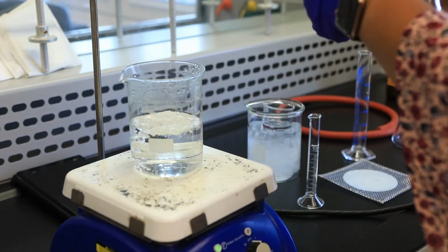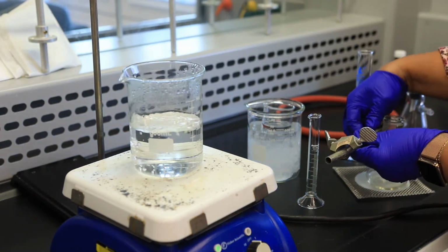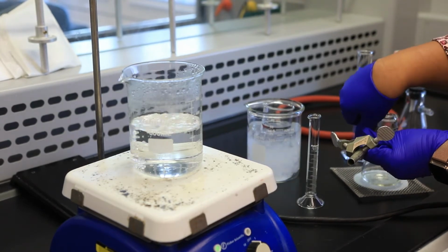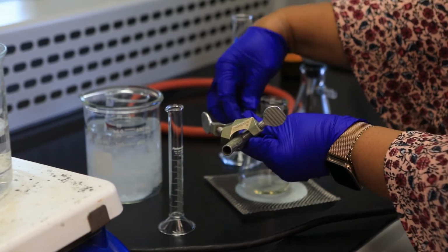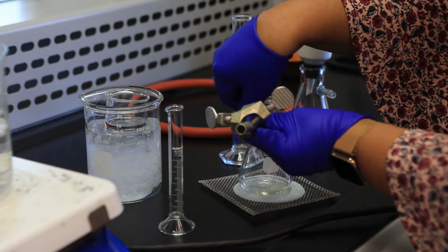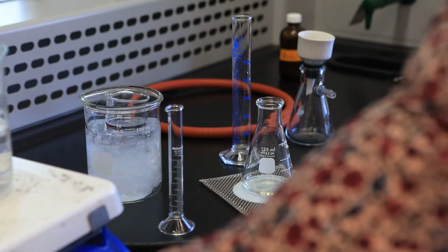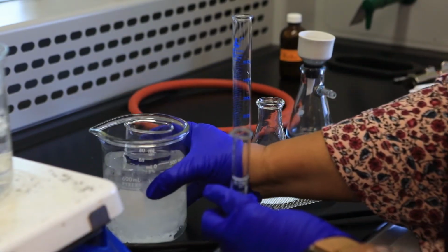I'm going to transfer it to a wire gauze, and we're going to allow it to cool for a few seconds. And then I'm going to go ahead and add 10 mLs of that chilled water.